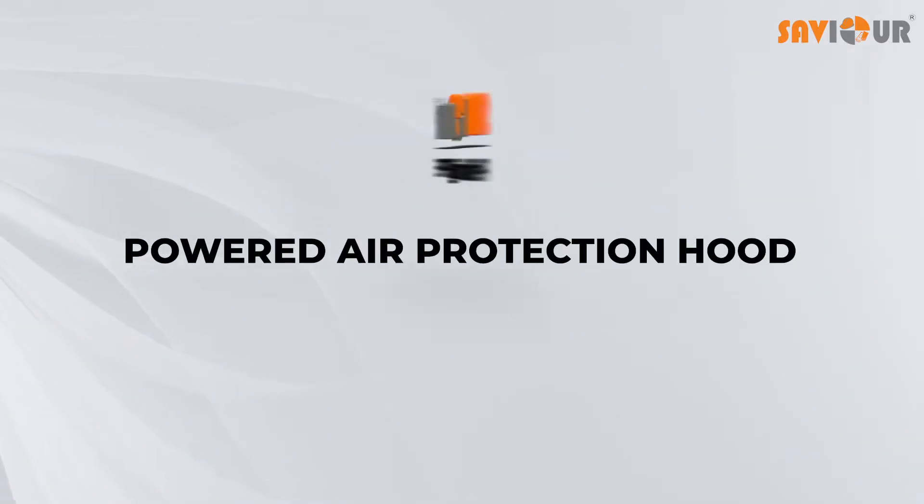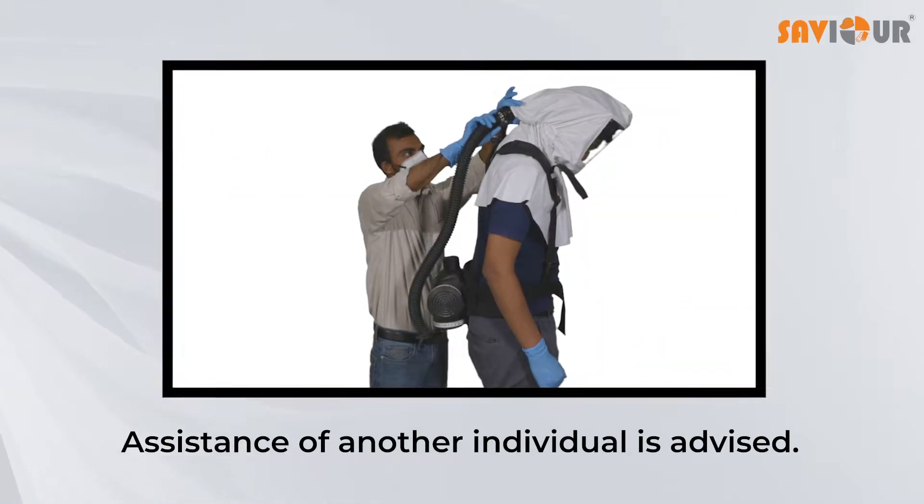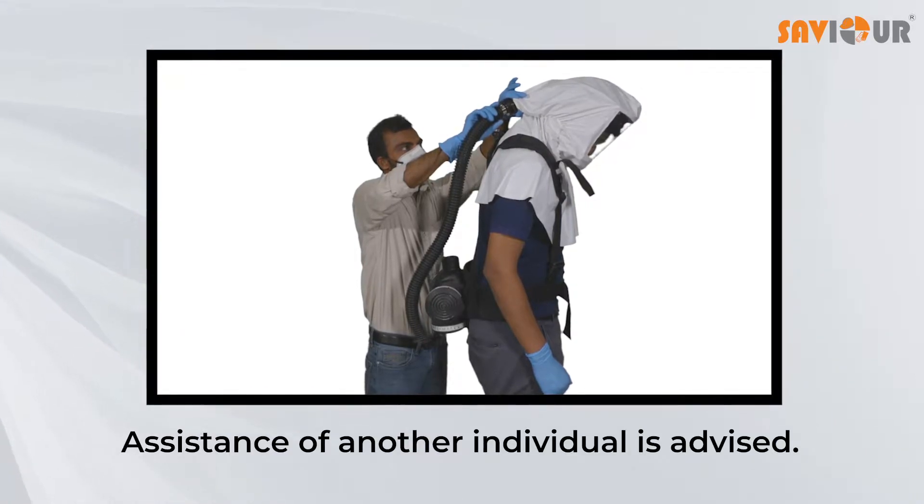Follow these steps while putting on or taking off the Saviour PAPH. It is advised to use the assistance of another individual while donning or doffing the hood.